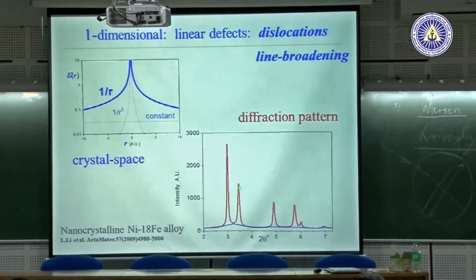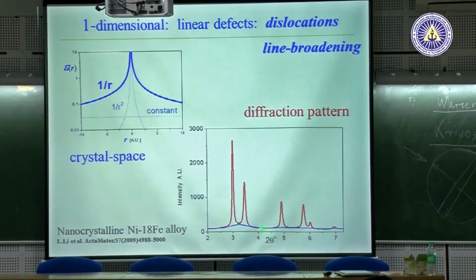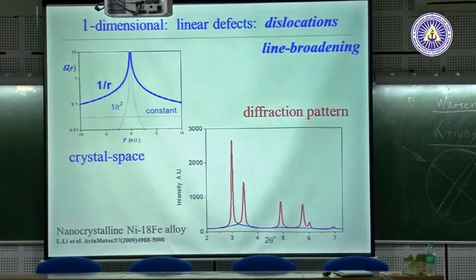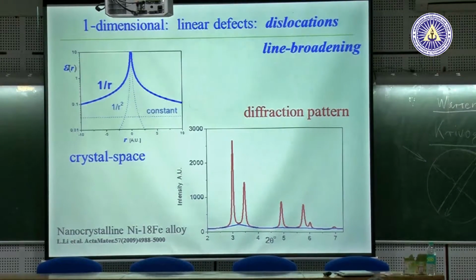And that is why it is small. Okay? So now the red is what the dislocations do, and this diffuse scattering at the bottom, which we have seen before, is now hardly seen, because the intensity goes up to 3000 instead of 40. So the difference is almost 100.